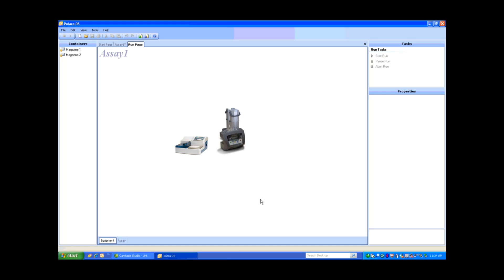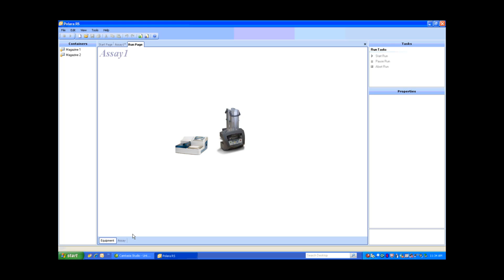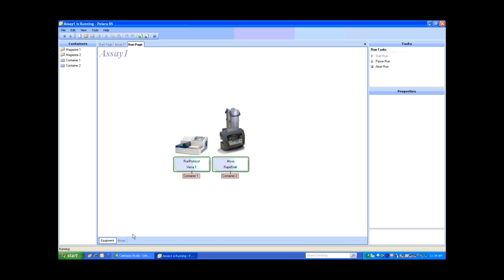You're now seeing the Equipment tab. I can also toggle back to the Assay tab, but we're going to stay on the Equipment tab because it shows you what's happening on the RapidStack and the Versa at all times. You can see on the screen we are retrieving from the RapidStack container 1 and moving it over to the Versa. Now you can see that Versa 1 is running the protocol on container 1 while the RapidStack prepares container number 2. You'll see this for the entire assay run. Now I'm going to switch over and show you what that actually looks like on the RapidStack with the Versa.